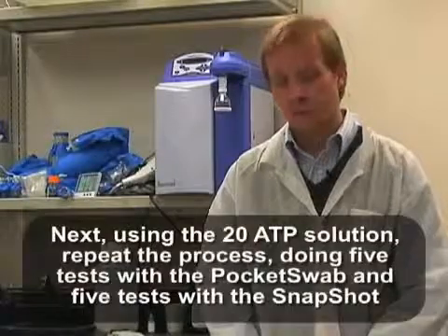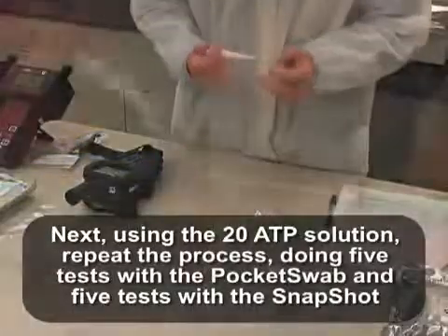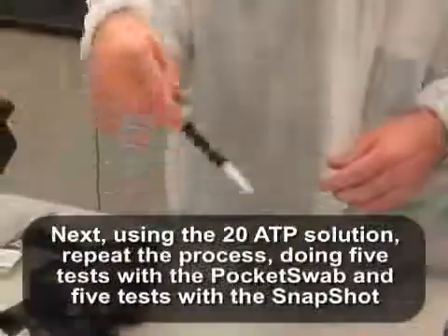Once I'm done with that, then I'll move to the vial containing 20 femtomoles of ATP, and again, I'll do 5 replicates with the Charm Pocket Swabs and 5 replicates with the Snapshot swab. Now that you've done your 30 tests and recorded all the results, it's important for you to calculate the average for each dilution and also the standard deviation.